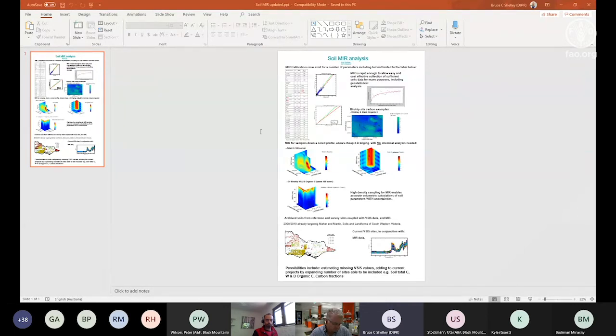It's been pointed out earlier, the test sample must fall within the matrix for which the calibration is valid. Sample preparation is really critical, and I can't remember whether the ASPAC call is asking for just results or whether they want to know what your sample prep is, but we probably should be getting that as well.